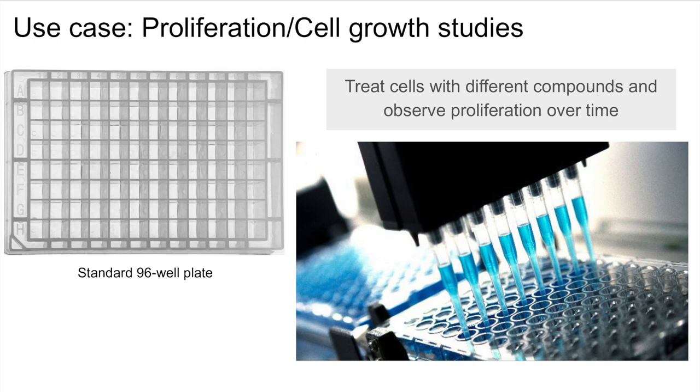Here, plates with many small wells are filled with living cells and treated with different compounds to study their effect. The number of cells or their phenotype is tracked over time to determine the impact of the compounds.